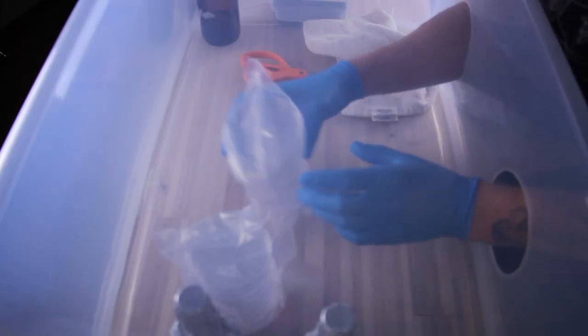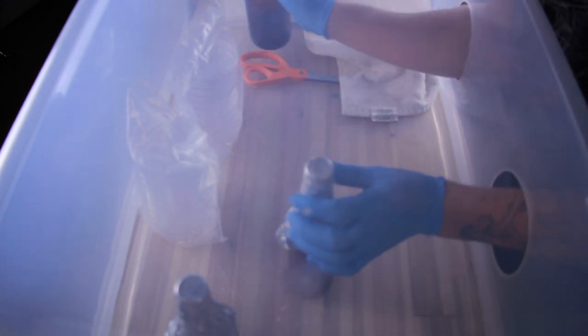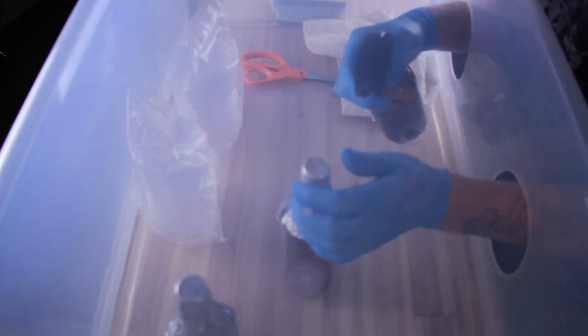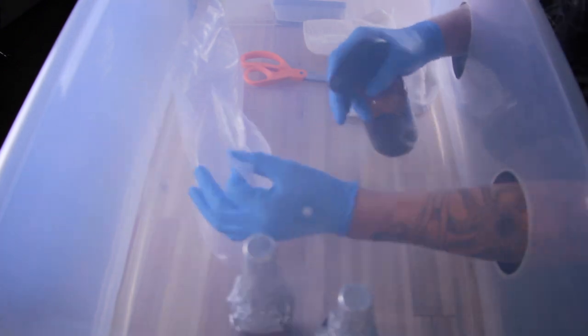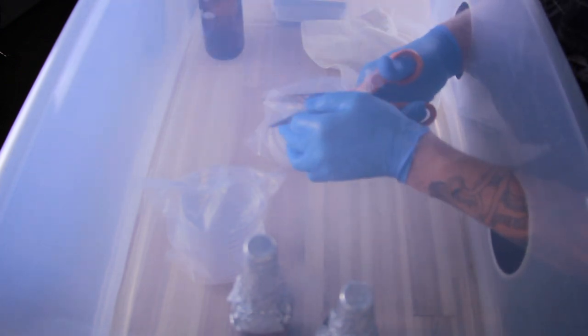I loaded everything into my still air box and got to work spraying everything down with alcohol. These petri dishes come pre-sterilized in a sealed bag, so I didn't bother sterilizing the petri dishes themselves, just sprayed the outside of the bag.